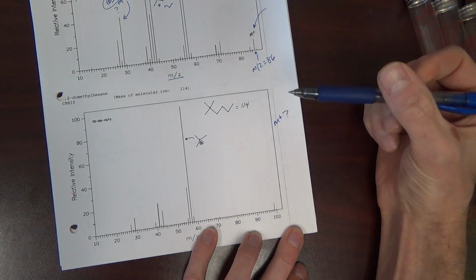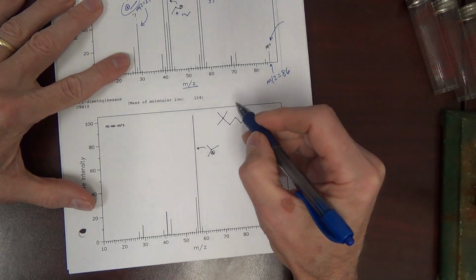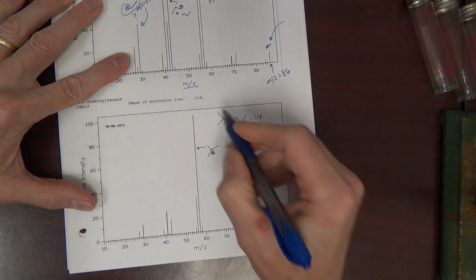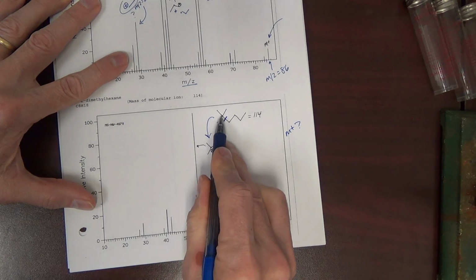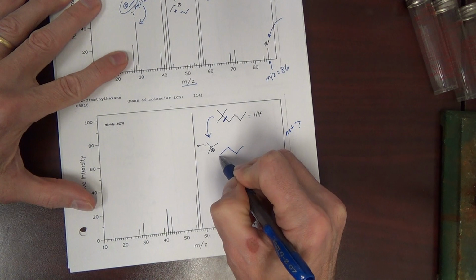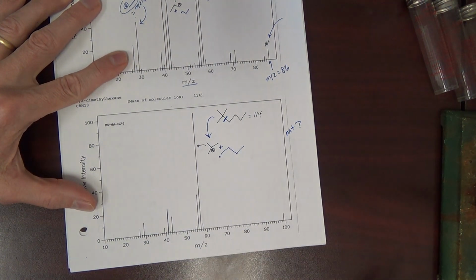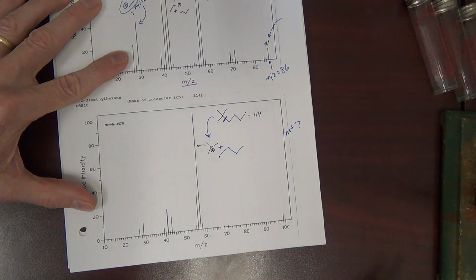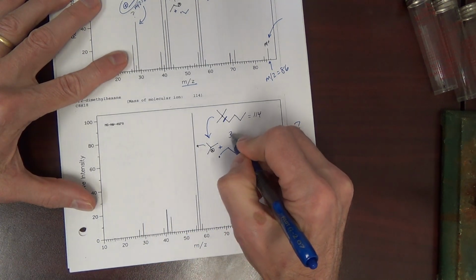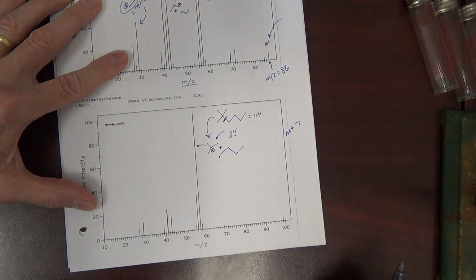Where would we expect this guy to cleave? Now this molecule, we would expect to cleave here to give the cation here as shown plus that radical. Why would we expect to cleave there? Because that's a very nice tertiary cation. Very nice. We can really predict that and expect that to be formed.